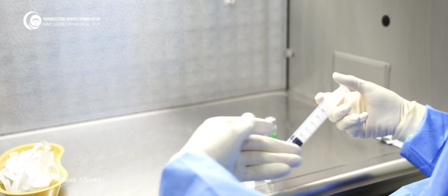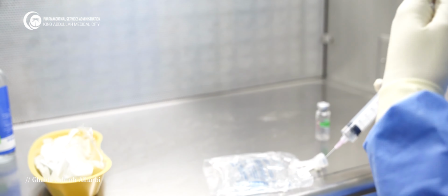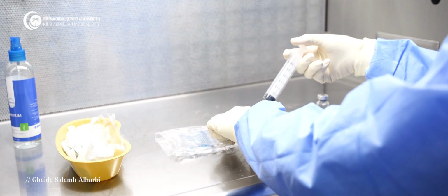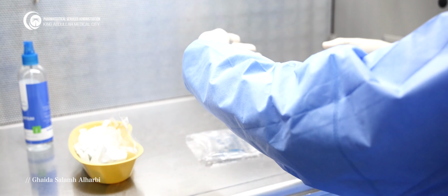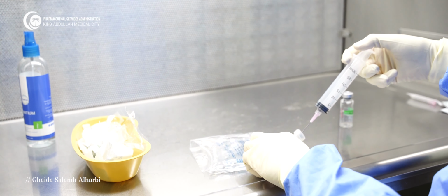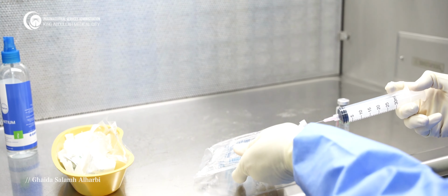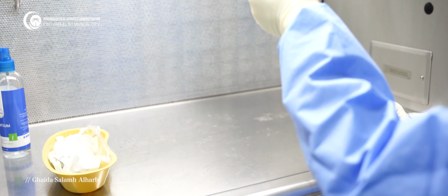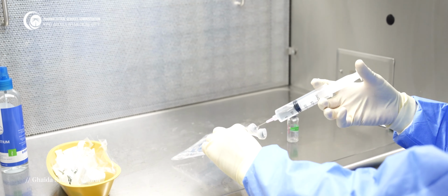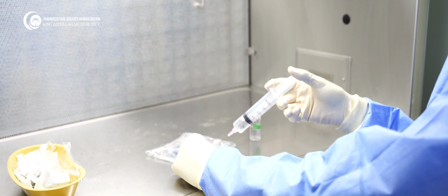See now in the picture, if I work in the outside part of the hood, this is far from the first air. Also, while I add the medication, now the bag's critical part is exposed opposite to the first air, so it's not exposed to the first air. We shall always keep the critical side in contact with the first air coming from the hood.